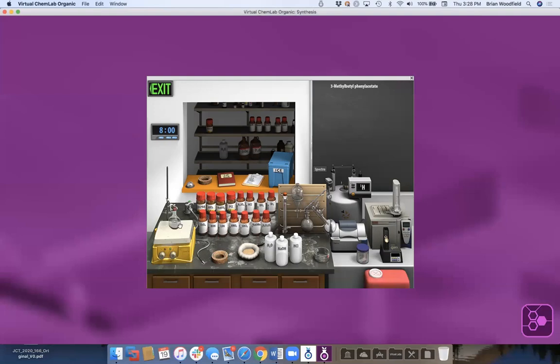Okay, great. Thank you. So let's say that you had a reaction mixture, you could do a distillation. So you can drag that, add the nitrogen. If you don't add the nitrogen, the thermometer pops off. And so you can come over here and actually distill this. So you had a mixture, it will distill over into your collection flask. It's empty, so there's nothing in it. Anyway, so you can distill and separate.